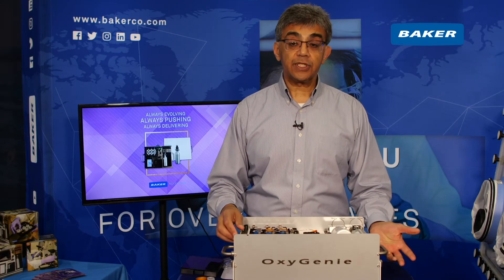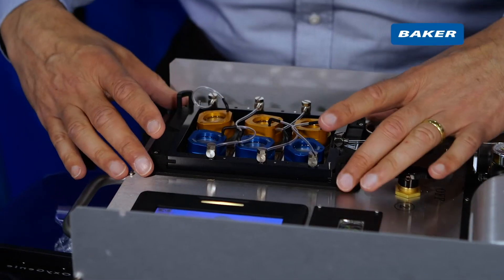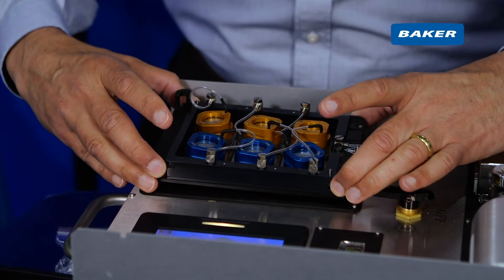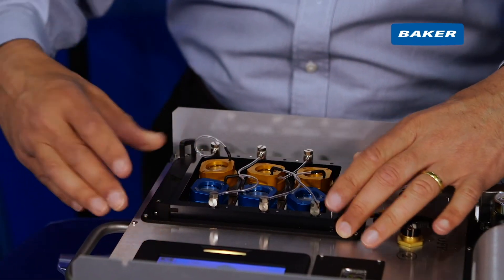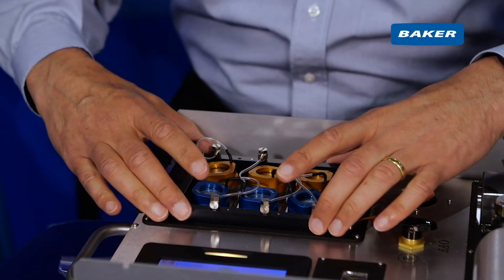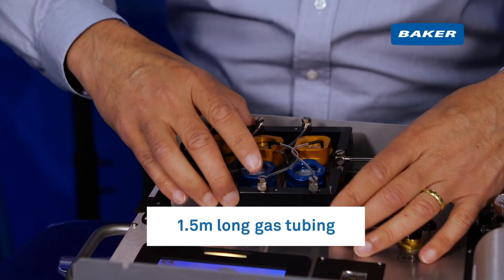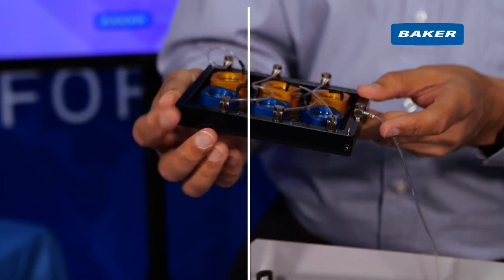Then you have two choices. You can either remove and disconnect individual sample cups, or you can remove the whole heated tray and sample tray. Alternatively, if I just open these two clips, I can take out the sample tray and place that directly onto a microscope stage.